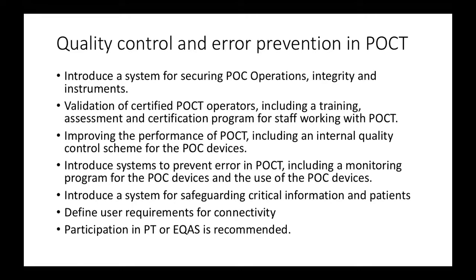For this, good monitoring is required for these point of care testing devices, and whatever critical information you are communicating to the clinician, you have to see that information. If you are telling telephonically, to address the requirement of clause 5.9.1 of ISO 15189, this information should reach only an authorized person so that the confidentiality of the patient is maintained.